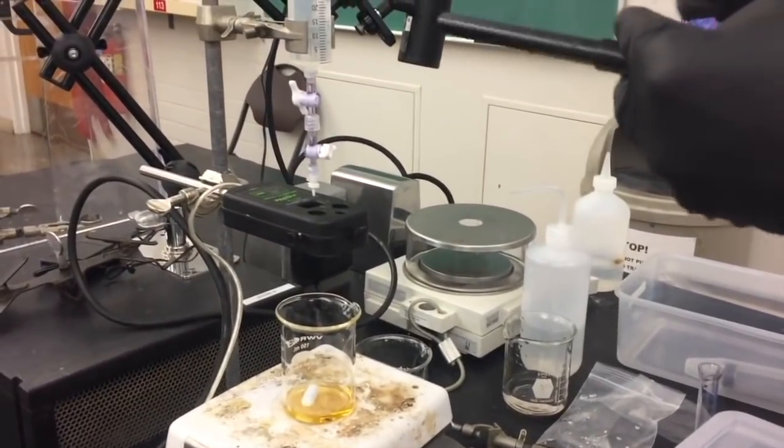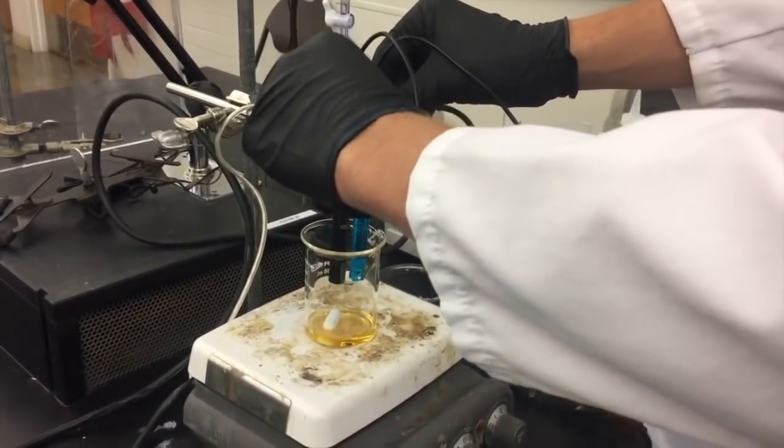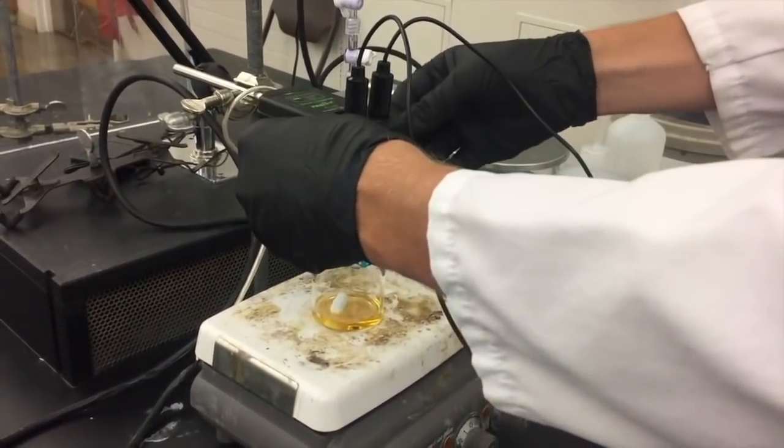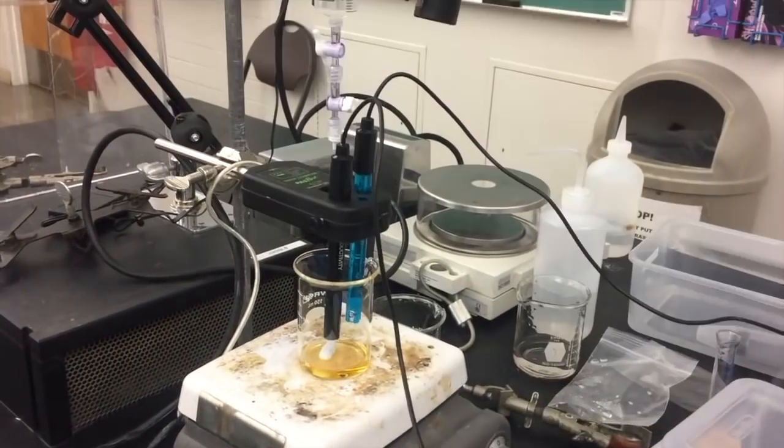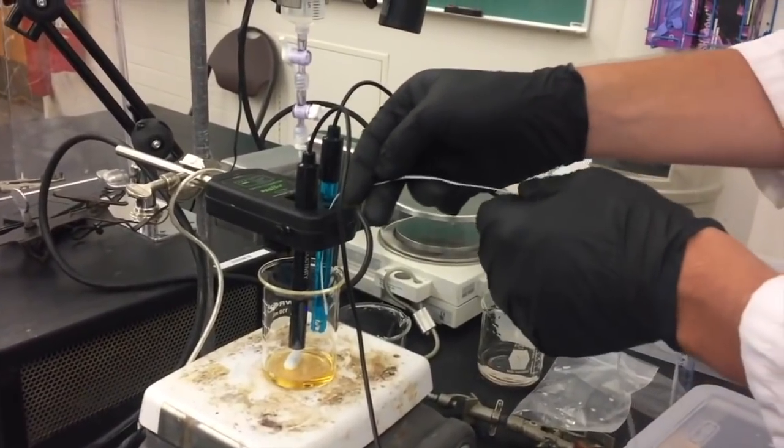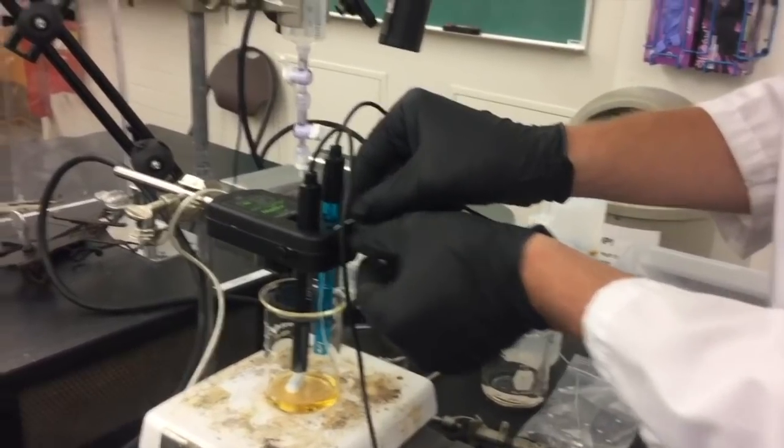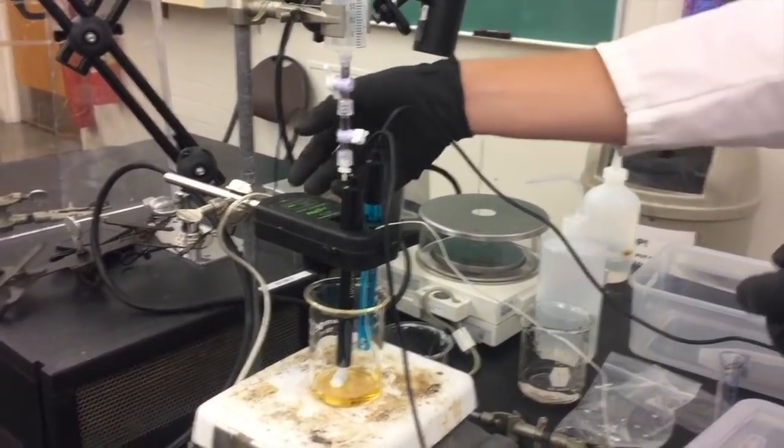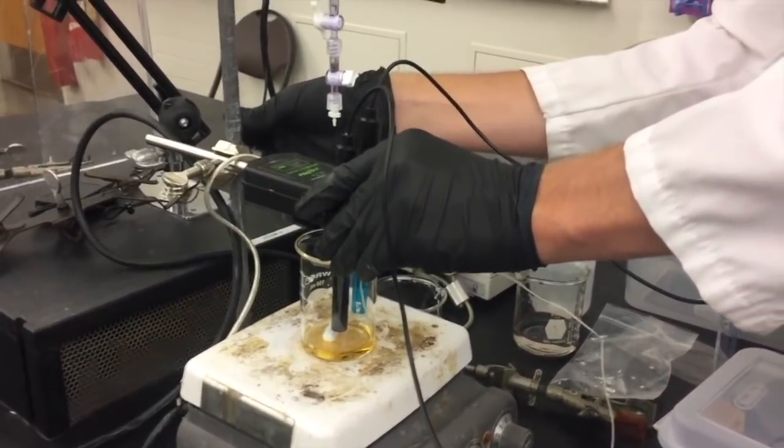Now we're going to position and adjust all of the probes. You should place the pH and conductivity meters through the big holes at the front of the drop counter like this and the thermometer should be placed through the smallest hole in the middle. Now you'll need to adjust the height of the probes. You want them to be as close to the bottom of the beaker as possible without touching the stir bar. You can use the screws on the sides of the drop counter to hold the meters in place.